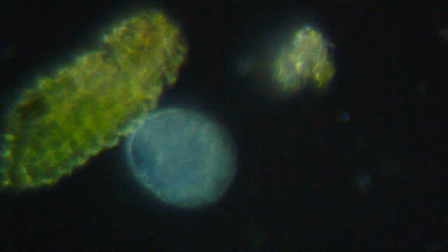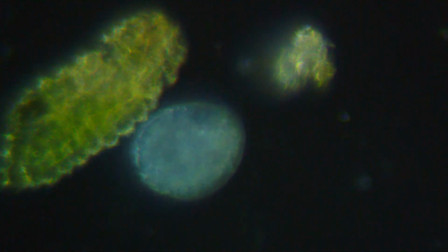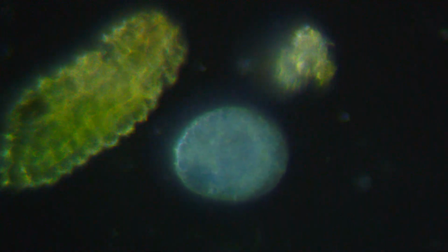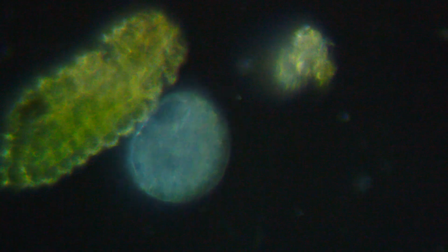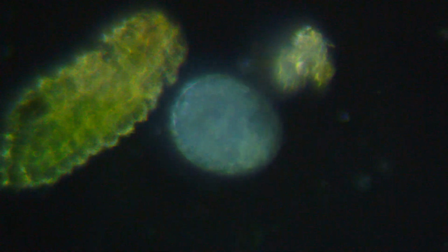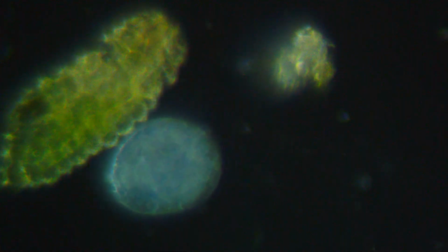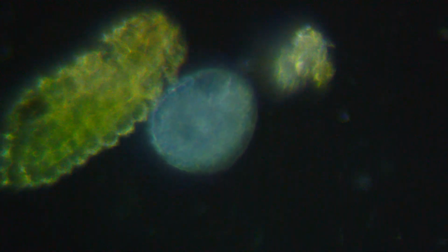The Tetrahymena is sort of an almost egg-shaped drawing in here, and it shows some of the objects inside of it, although this appears sort of fibrous to me as far as the insides. Maybe it's just that we're focused on the surface skin, but he appears to be eating this green corn-looking algae.